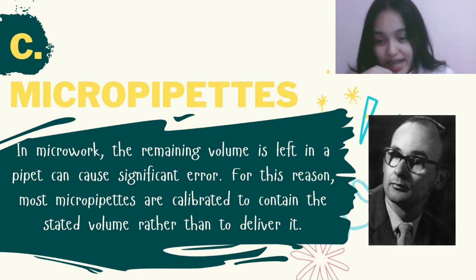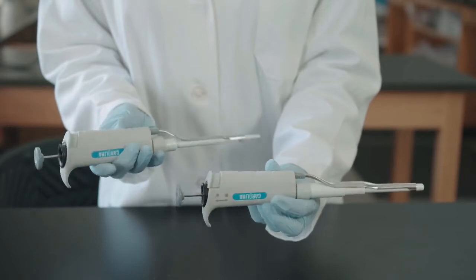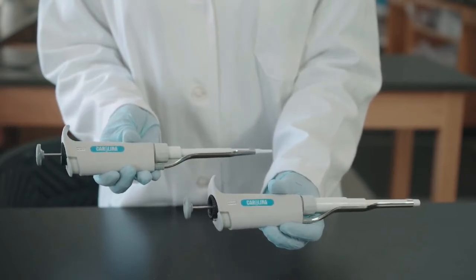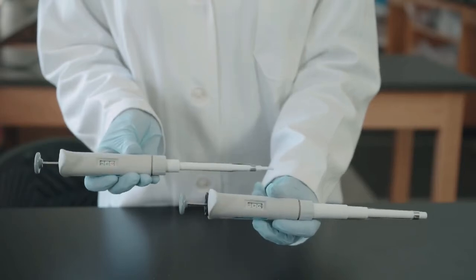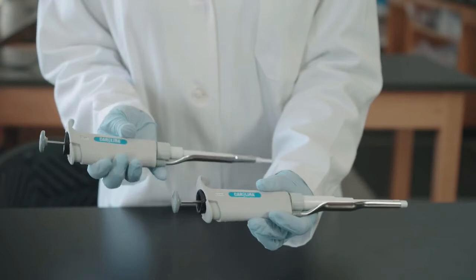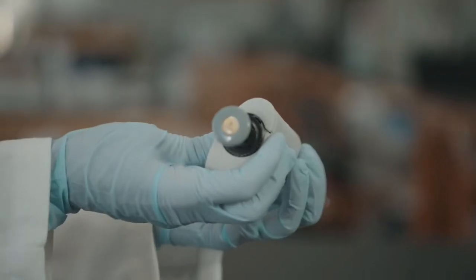mistakes in utilizing pipettes. Micropipettes are used to measure small volumes, usually volumes smaller than a milliliter. There are different types of micropipettes for measuring different ranges in volume. Each pipette is marked to indicate what range of volumes the pipette is used to measure. This is a P1000.